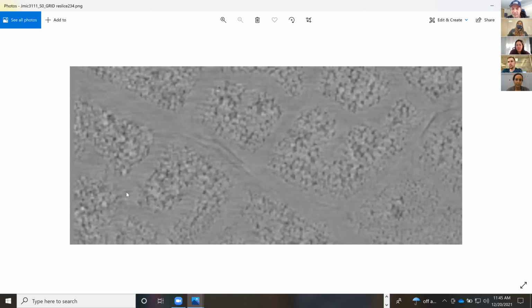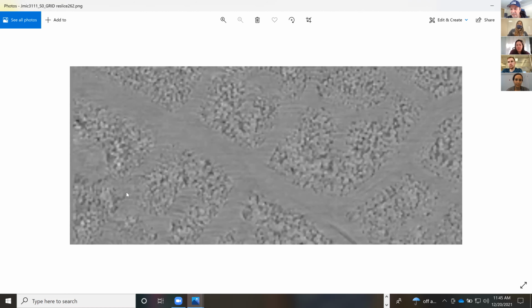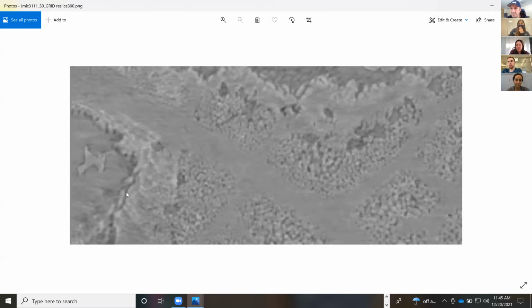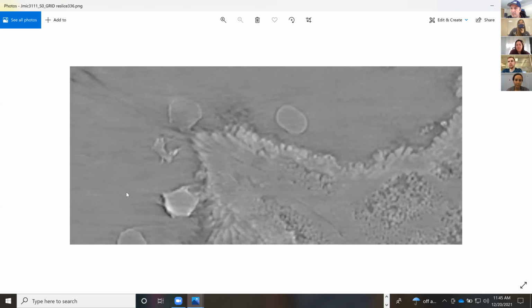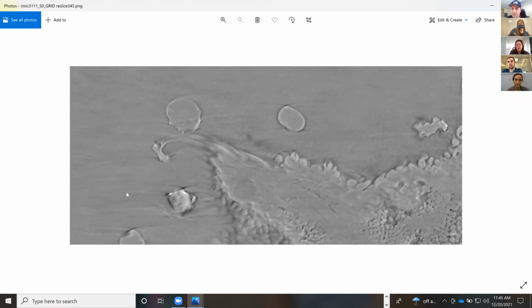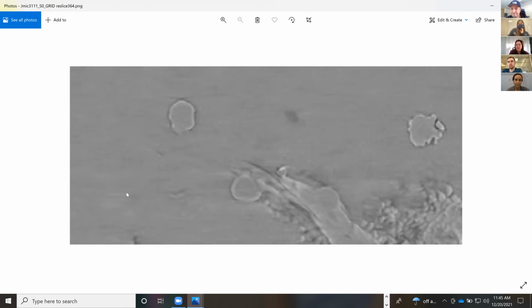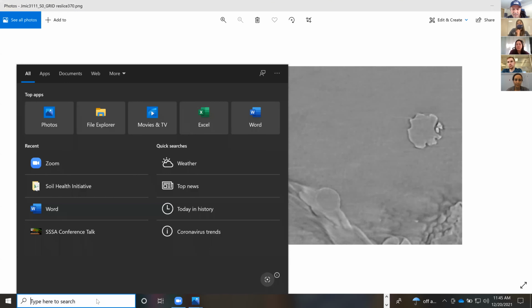And so it would be entirely possible to do it from this direction and mark the stomata. Stomata are hard to see from the other direction. The computer just doesn't see them very well, just because they're so small.